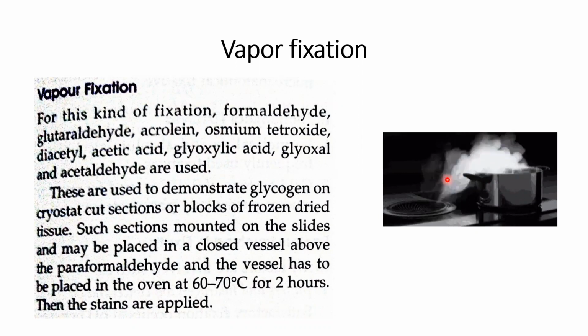Okay, so the vapors will fix the tissue, and this needs to be done in the laminar hood, because these vapors are really irritating and they are also carcinogenic in nature. So we need to perform this vapor fixation only within the laminar airflow hood. It has the advantage of laminar airflow: it will absorb all the fumes that are emitted. It is a uniform system, so the vapors will be reabsorbed by this hood.